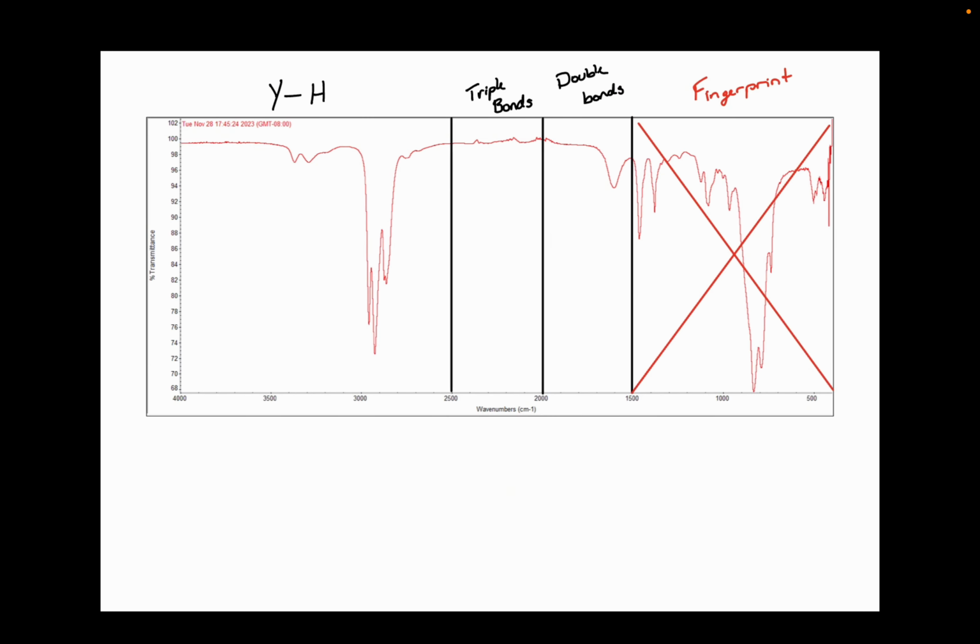There's one way that you can help analyze this portion of the spectrum, and that is to lay down yet another line at 3000. This will distinguish between this group of peaks that we see quite often, right here, which are our sp3 carbon-hydrogen peaks. But if we had a double bond or a triple bond, they would appear over here for a double bond or over here for a triple bond. So that helps you see whether or not you have any sp2 or sp hybridized carbon-hydrogen bonds going on. Okay, cool.